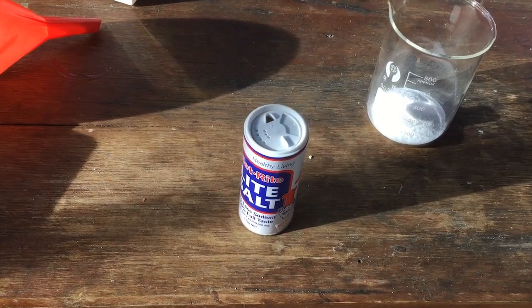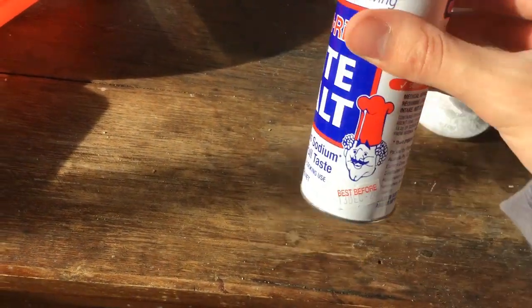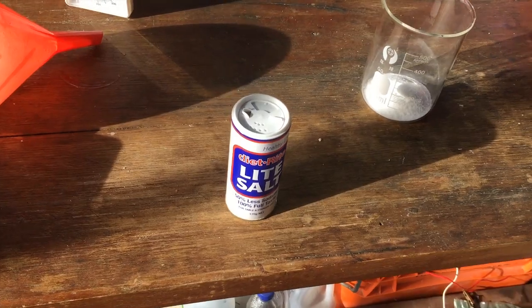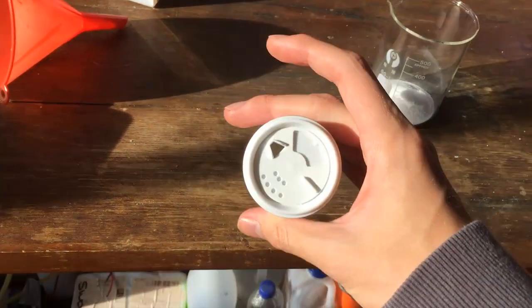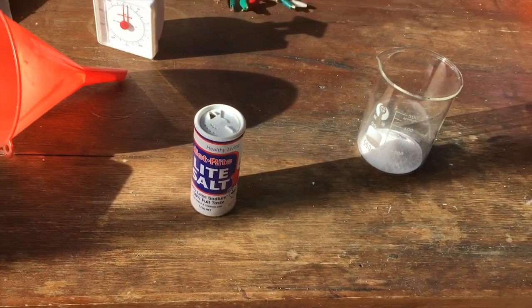Before we go any further, I thought why don't I give it a taste test just to see if it does actually taste like salt as it says on the packaging. It kind of tastes zingy, a bit weird. It doesn't really taste like salt, but it's better than nothing if you're on a low sodium diet. I guess I'd put this on my food instead of just having nothing.